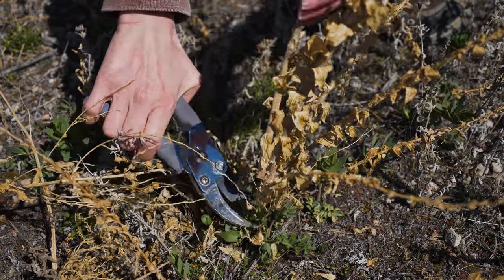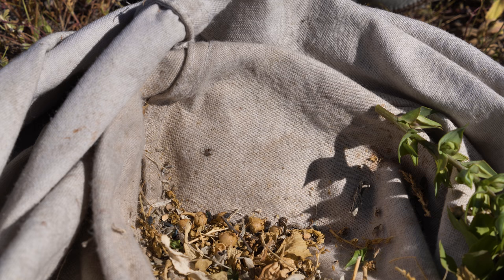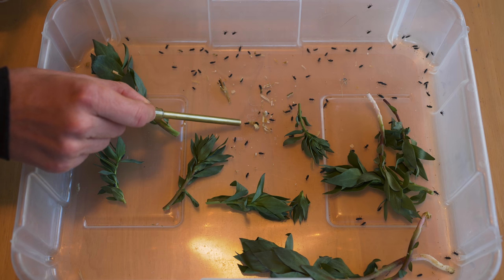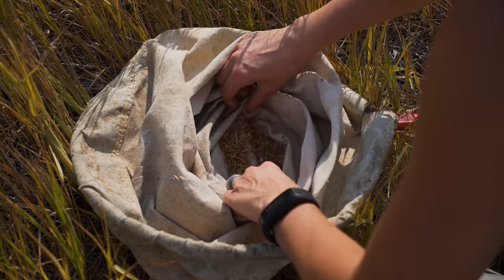Regardless of the method you use to field collect weed biocontrol agents, extraneous debris, such as other insects or weed seeds, must be sorted and removed. This can be accomplished in different ways, such as using sorting trays and an aspirator, or picking out the target biocontrol agent by hand.